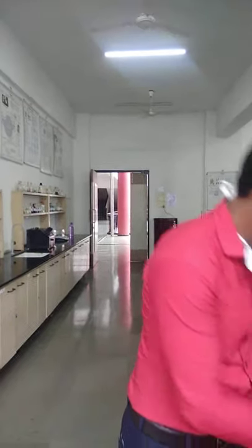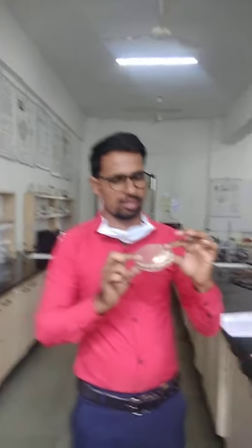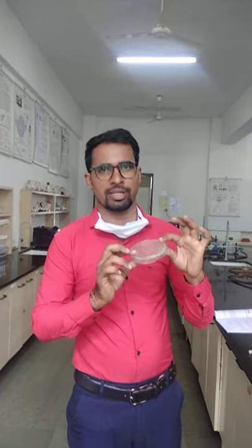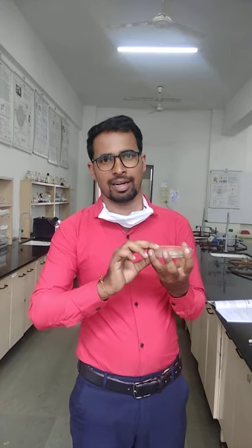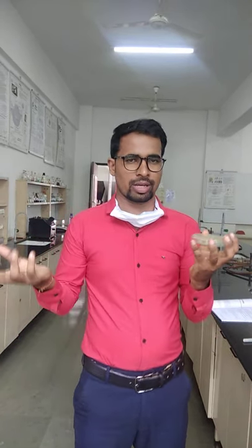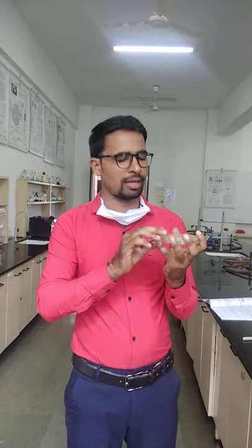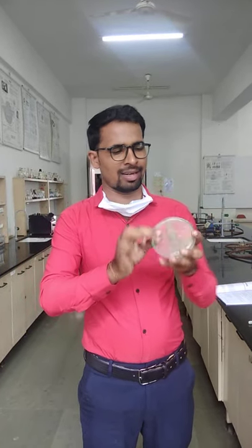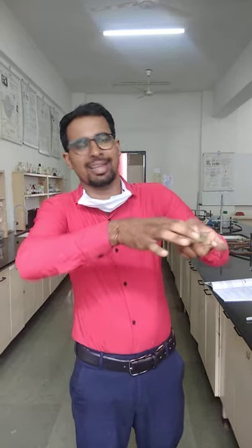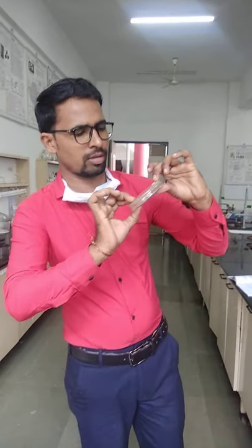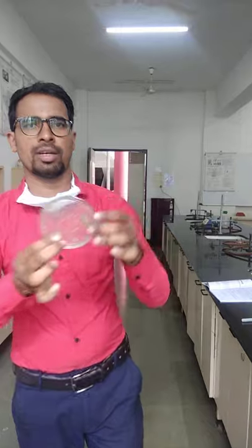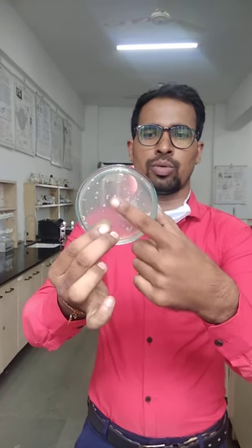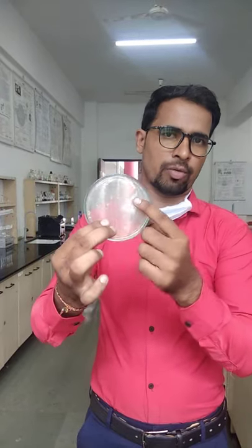Here we have a petri dish. I already told you about the petri dish. This petri dish is useful for plating the agar, or you can say for the preparation of media. This is the petri dish which is useful for the growth of microorganisms. You can see here the base as well as the lid. It already contains media and you can observe some microbial growth also. This was already used in the previous practicals.